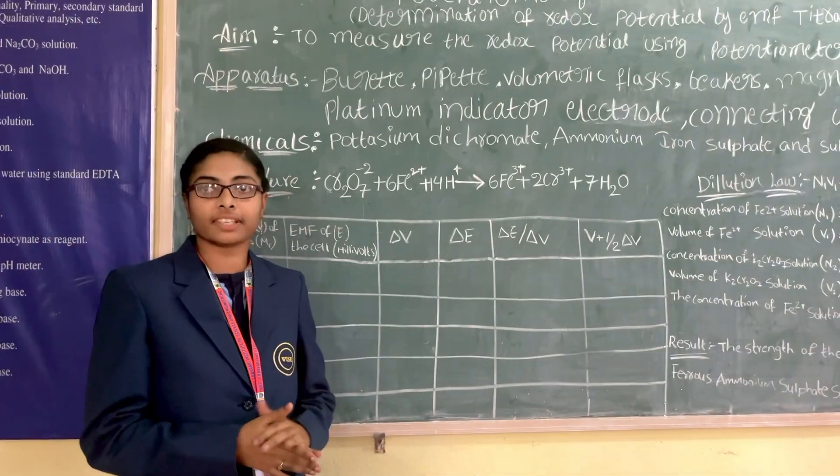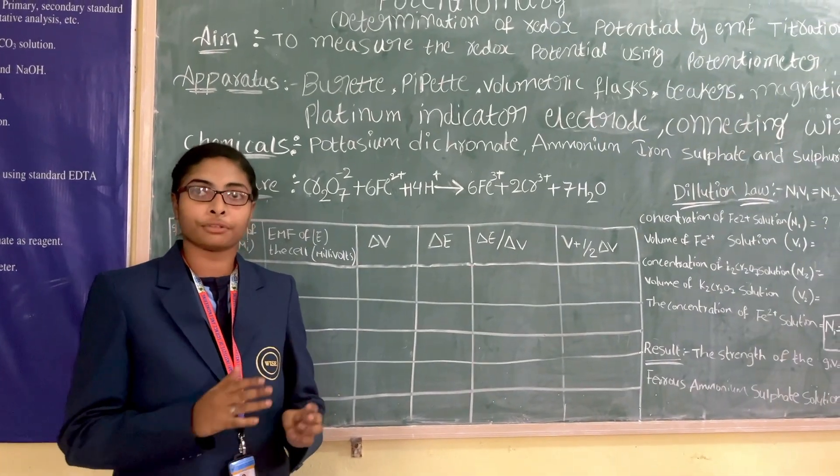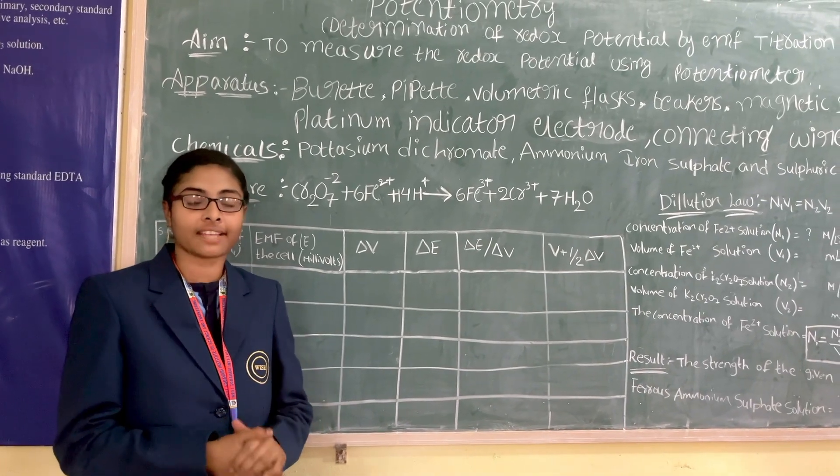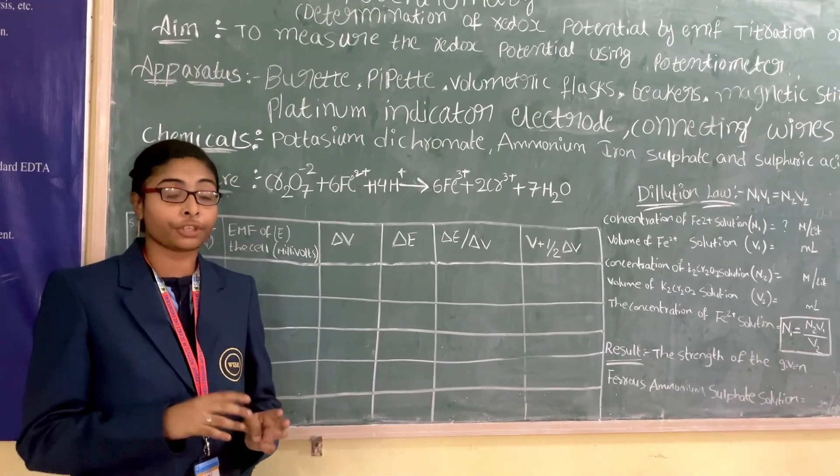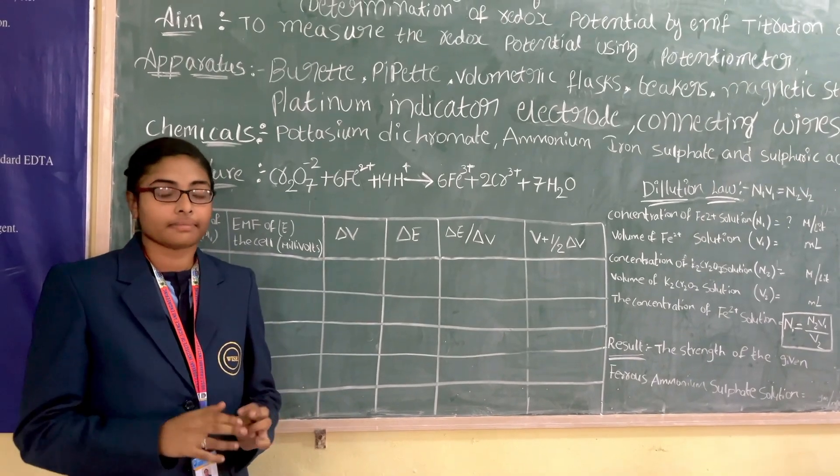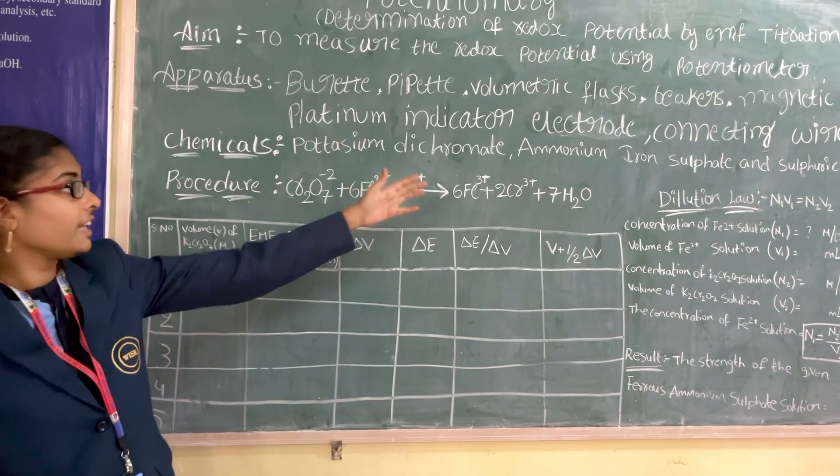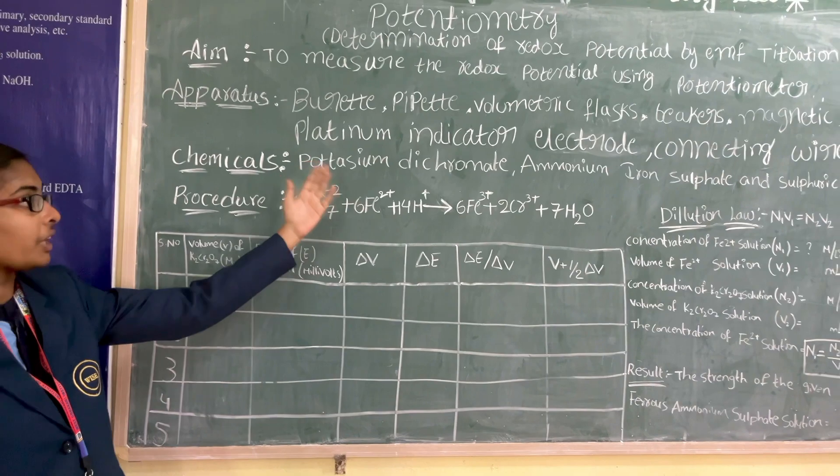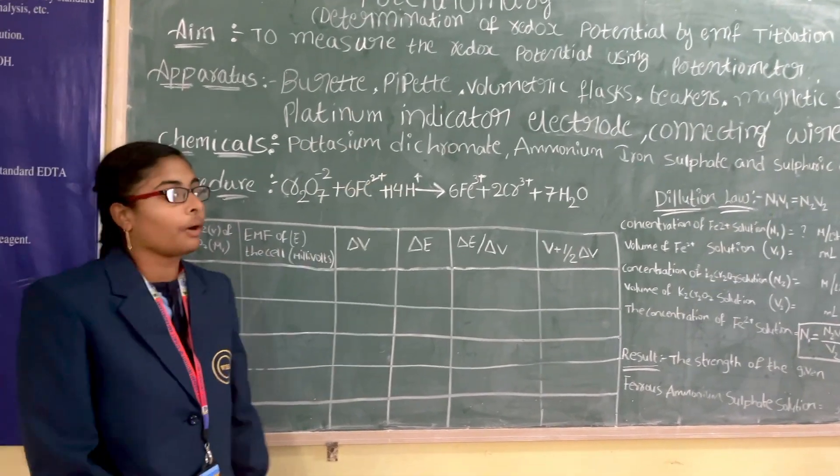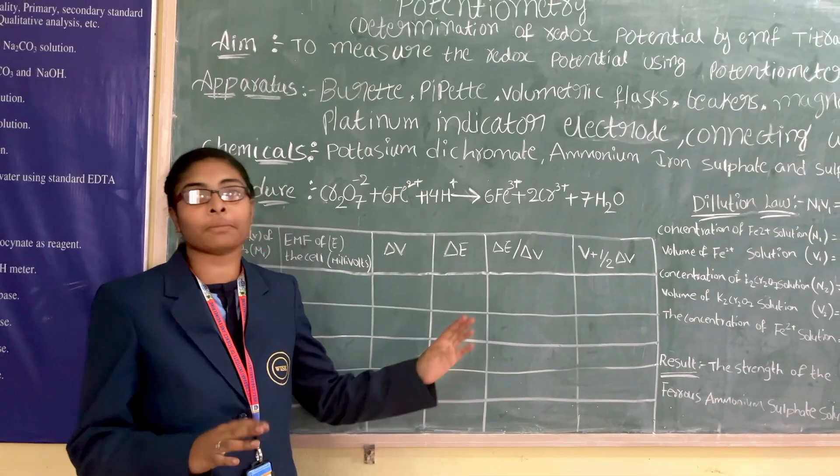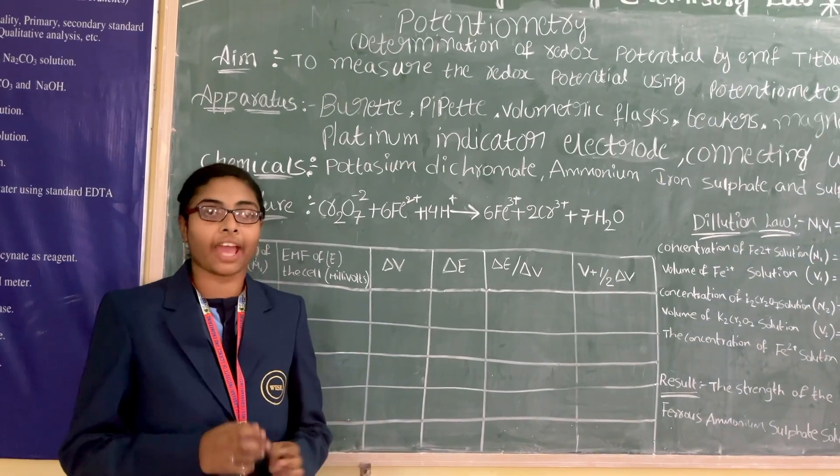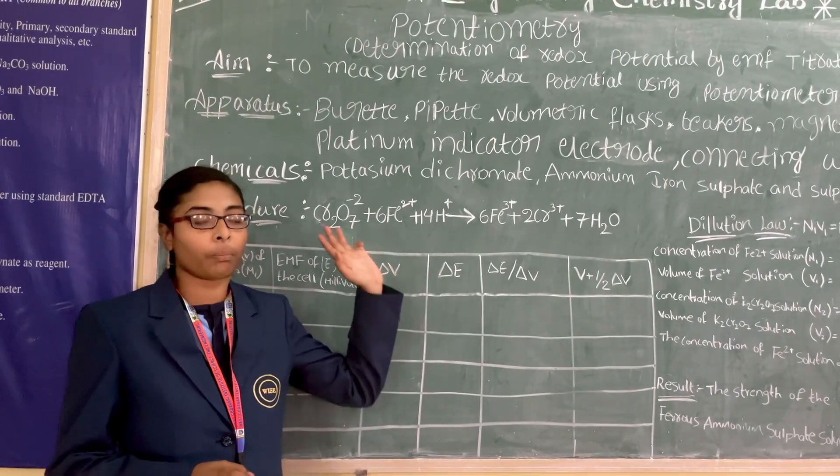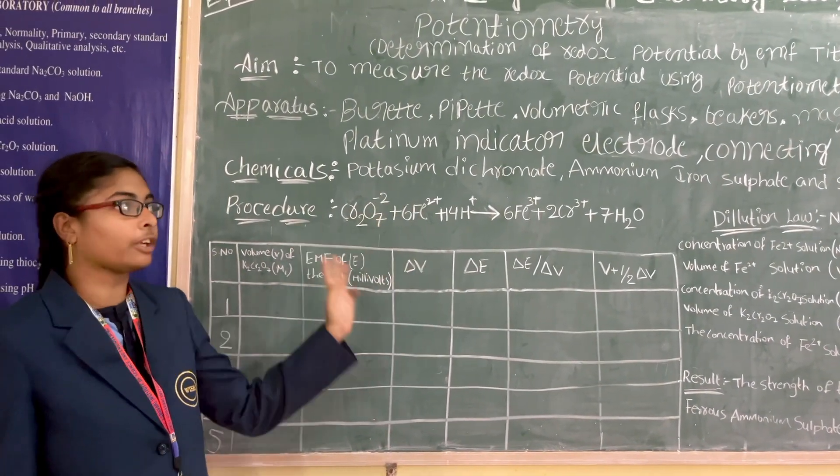Going to the procedure: take 100 cubic cm volumetric flask and add 0.01 ammonium iron sulphate and 0.02 potassium dichromate. Stir with the magnetic stirrer and add 0.02 ml of dichromate solution.